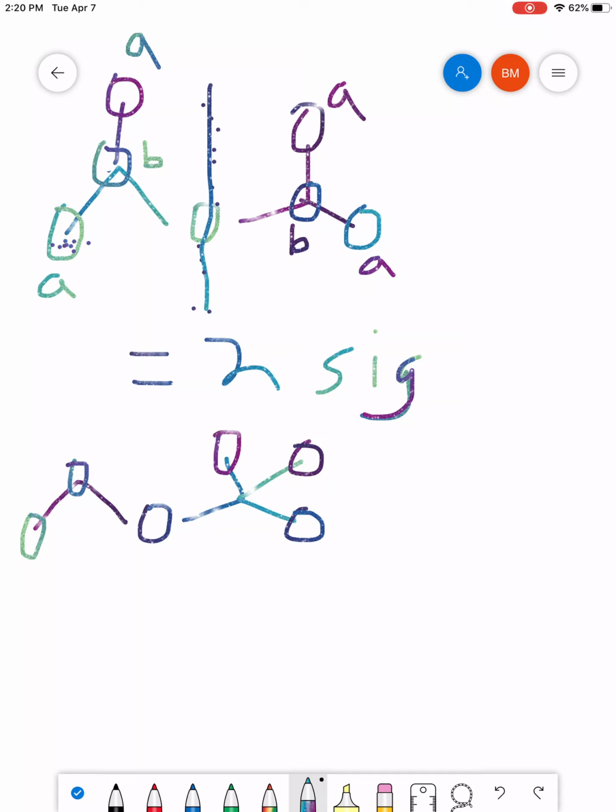All right. Now, looking at these, if I am looking for possible points of equivalence, I think I can safely say that these 3 methyl groups over here on the right side, if you look at their individual environments, are all going to be the same as each other. I'll call these group A. And then these H's on the other side are quite unique. They're not the same as each other, and they're definitely not the same as what we see in group A. So this one, I believe, would have 3 signals.